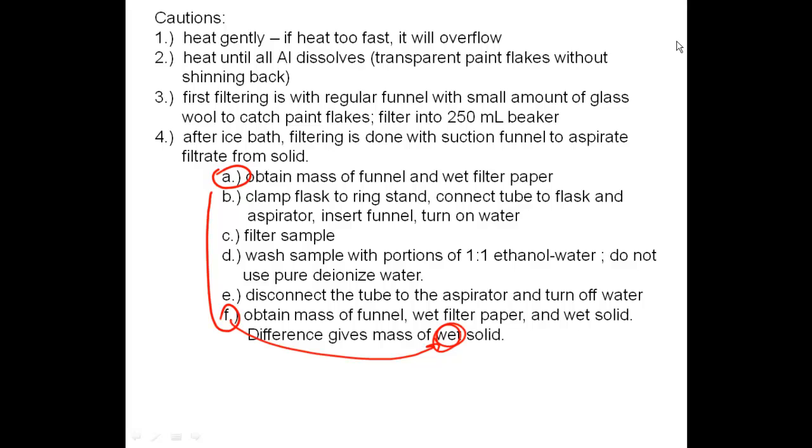We don't have time to dry the sample and get actual mass, so we're just going to use whatever you get. So just make sure you note that as a source of error in your experiment. This sample is still wet, so the actual final mass is not the mass of just your complex. It's also the mass of water involved there as well.